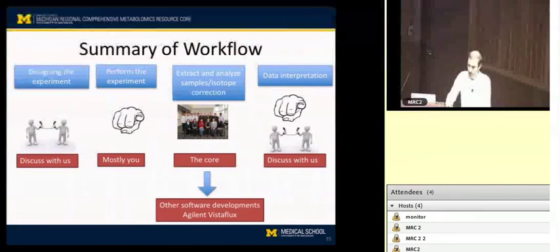A Seahorse can tell you to some extent whether it's coming from oxidative metabolism or from glycolysis and lactate production from anaerobic metabolism. So by combining that global picture of what happens to my total rate of metabolism under different conditions with a look at which metabolic pathways specifically are showing alterations in flux, you can establish a much more complete picture. So really, they are very complementary. We do them all the time, and so it's a great approach.